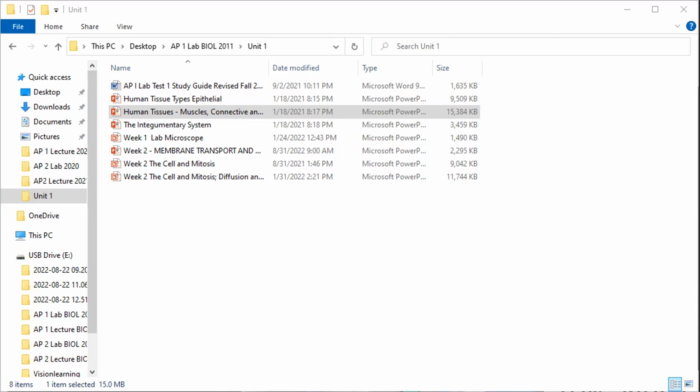And I'm going to weigh it. The distilled water cell weighed 30.2 grams initially, and it dropped to 29.8.